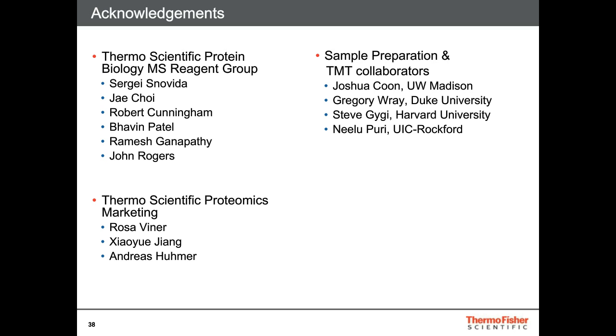Okay. And I just refreshed, and we've got lots more questions, so hang in there. If I use both an iron NTA and a titanium dioxide for phosphopeptide enrichment for the same sample, is there a percent increase in the peptide IDs that I can expect?